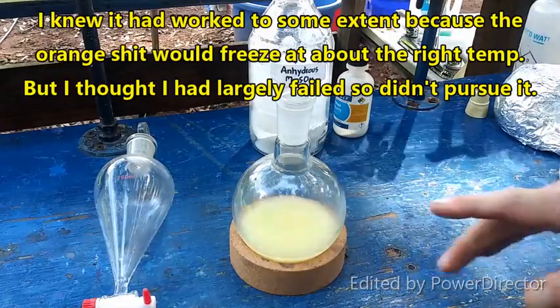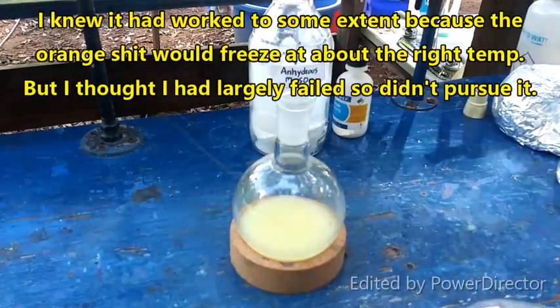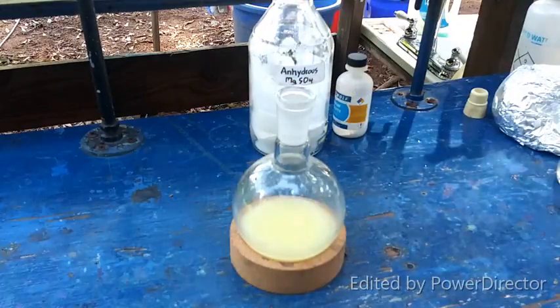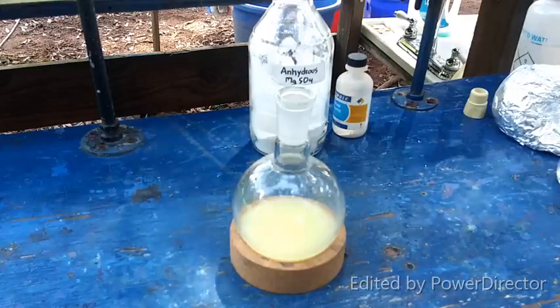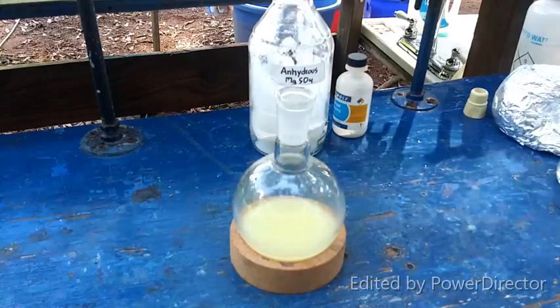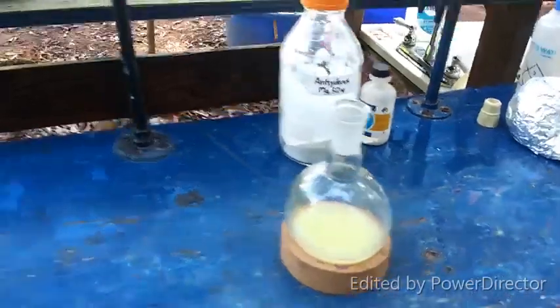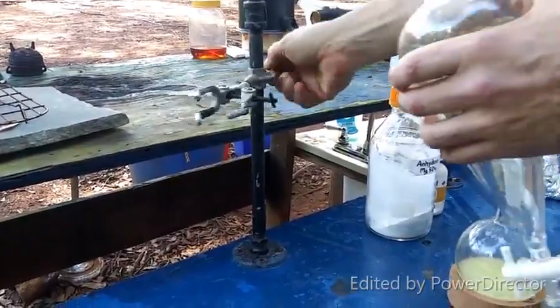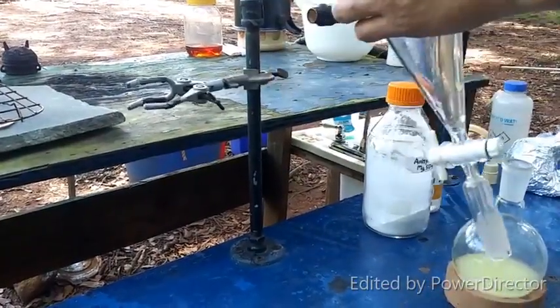What we need to do is transfer this over to a separatory funnel, although I think I'm going to get a bigger one just to be on the safe side. Let's get this all set up here.